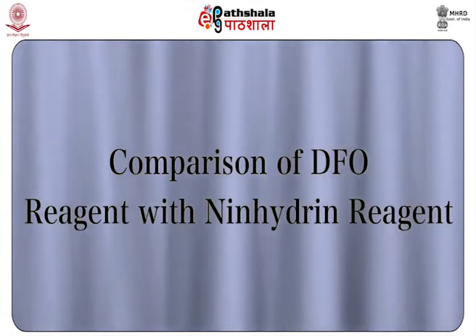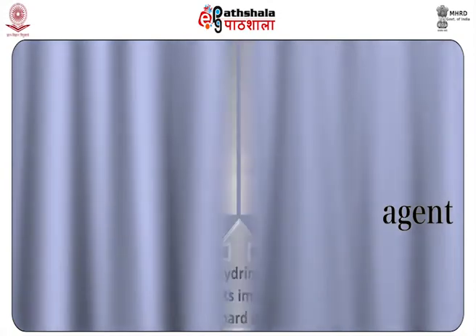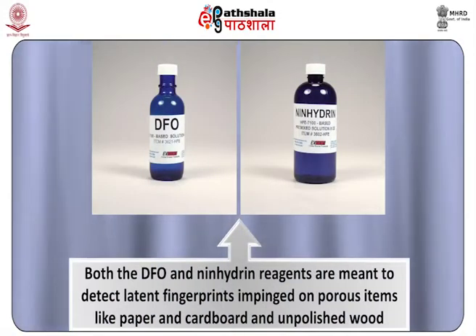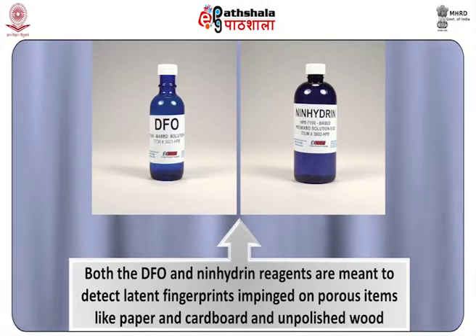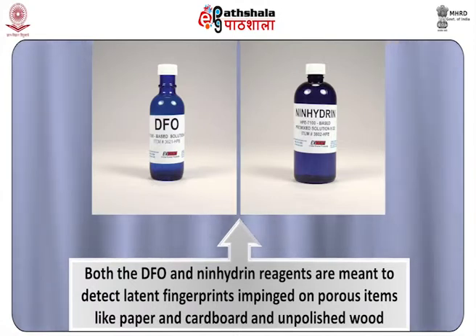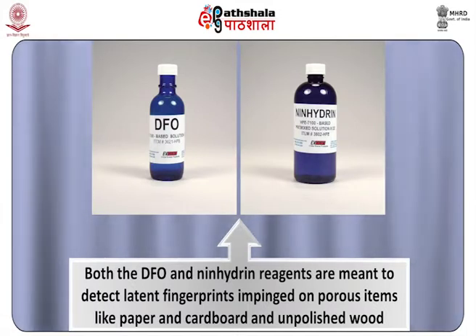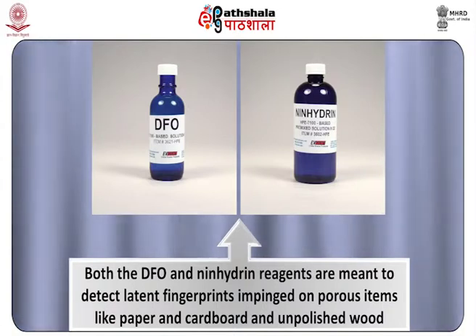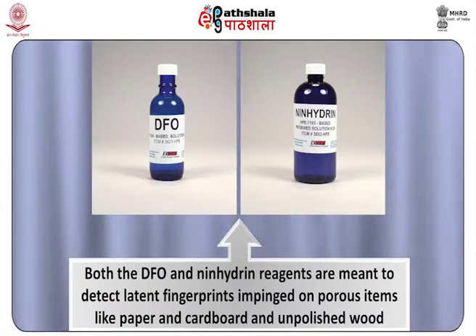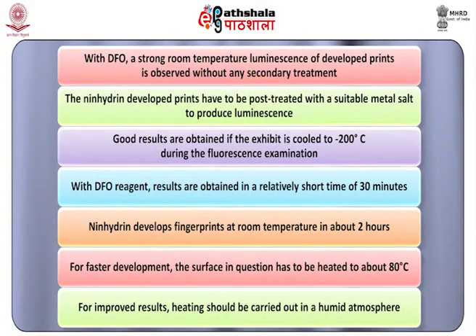Now let us see a comparison of DFO reagent with Ninhydrin reagent. Both the DFO and Ninhydrin reagents are meant to detect latent fingerprints impinged on porous items like paper and cardboard and unpolished wood. It is therefore pertinent to weigh out the utility of one reagent vis-a-vis the other. The DFO technique offers the following advantages over the Ninhydrin methodology.